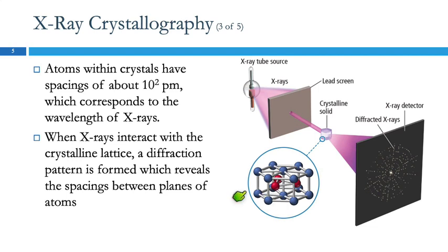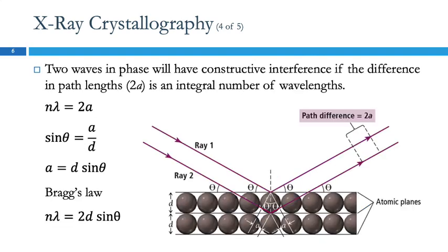This is a ball and stick model. Obviously, the sticks aren't there. But depending on how these atoms are spaced and arranged in that crystal, you'll get different patterns here. So this is part of what's going on. This is some geometry, actually.